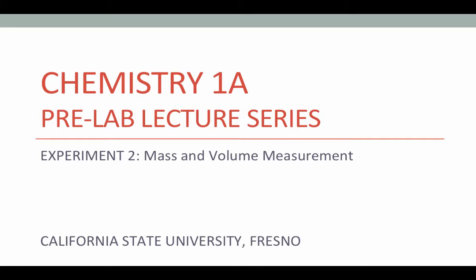Welcome to the Chemistry 1A Pre-Lab Lecture Series. Today we'll be preparing to do Experiment 2, Mass and Volume Measurement.